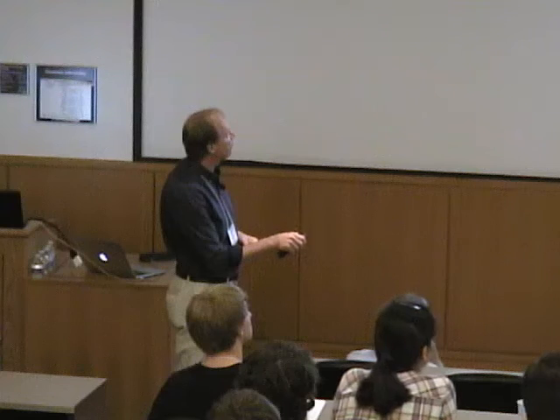If we, on the other hand, look at an iron-sulfur cluster, because it has a transition metal and larger spin-orbit coupling, the components are different. This again is our iron-sulfur clusters from photosystem 1. We can see here our cluster FA with its 3 main components, and it's easily resolved already at X band, and we don't have to go to higher frequencies. So there's this qualitative difference between metals and organic radicals. Usually organic radicals are not resolved at X band. Metals very often are.